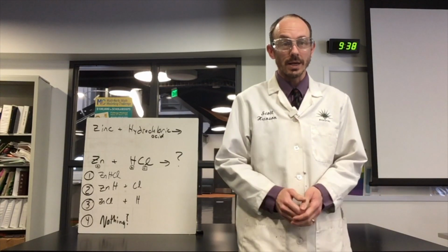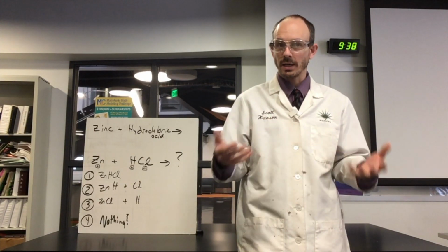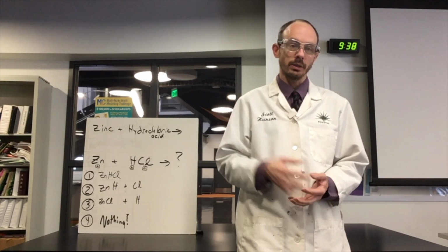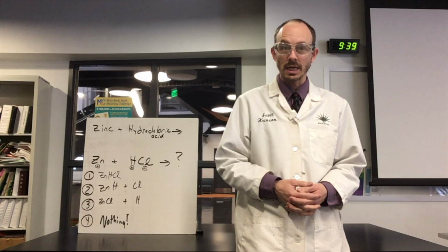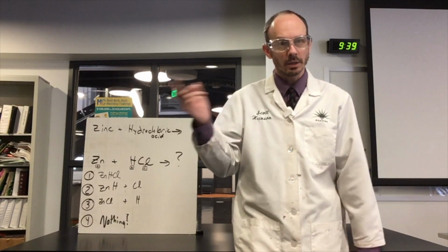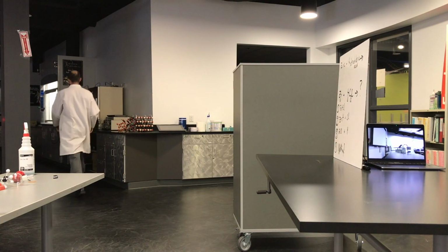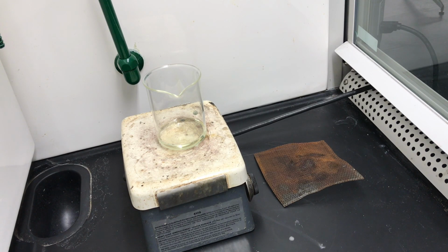Hey guys, I know that it does not seem like much time has passed for you, but we have actually had an entire day pass. Let's take a quick look at the material inside the fume hood. I've got a camera on it, and we are about to start heating that and evaporating away the material. So let's move over there. And notice that it's yellowish in color. That's just some impurities inside the hydrochloric acid.